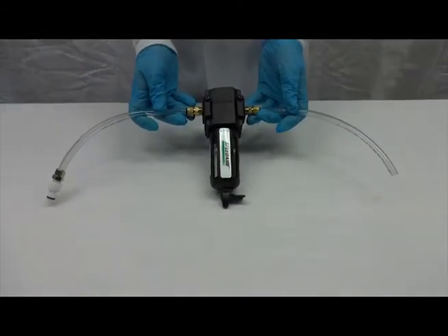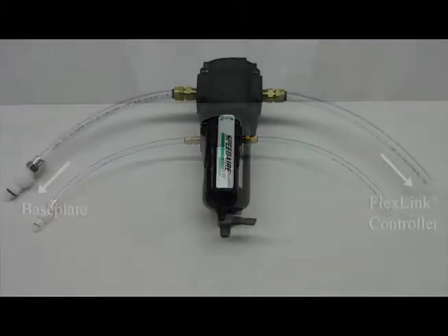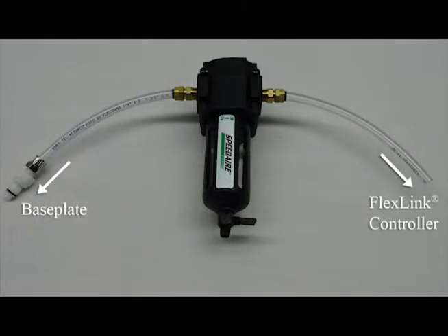Place the water trap at a position below the flex link unit. Check the water trap prior to each experiment to see if water is accumulating. Empty the water trap before it is more than half full.